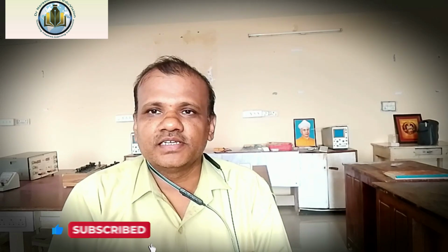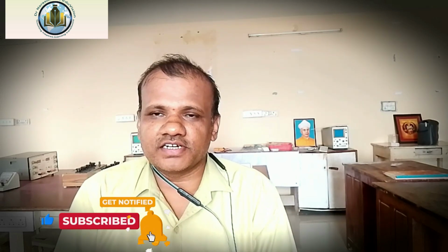Narsimha's Eduvision. So in the previous video, I showed you how to calculate lattice parameters by using the analytical method without using any software package. But this method has some limitations. In the analytical method, we did not consider the XRD peak width, that is nothing but the full width at half maximum. The width of the characteristic peak we did not consider. It plays a major role in determining the nanoscale size of a particle.